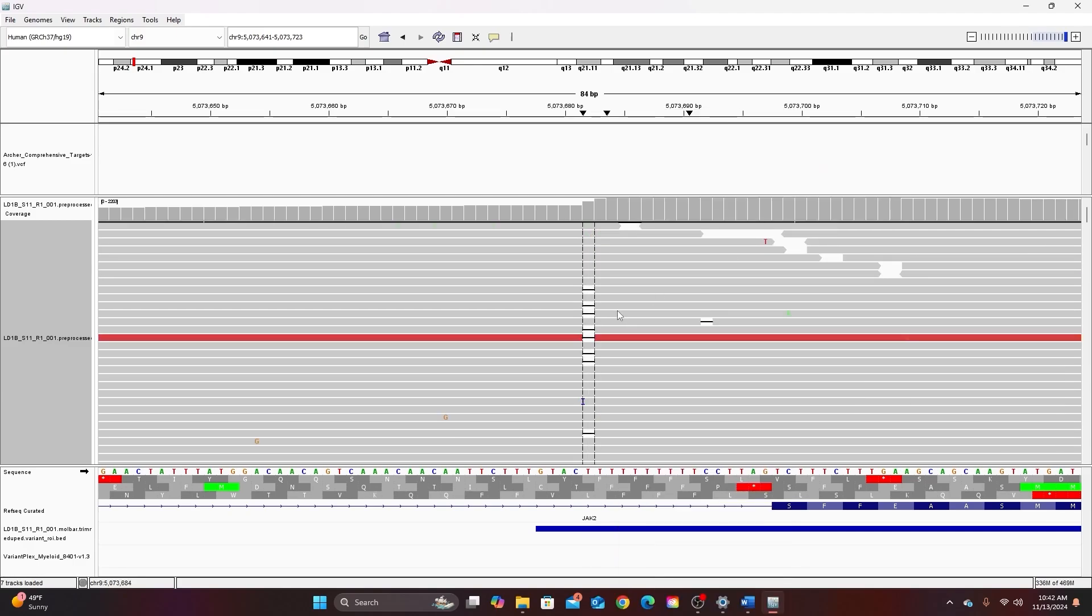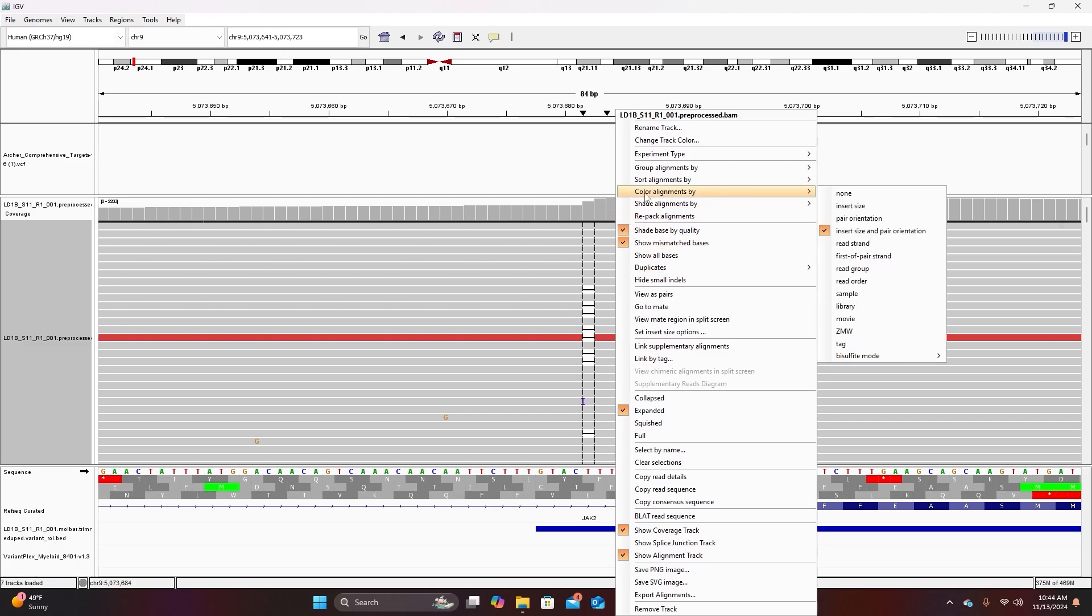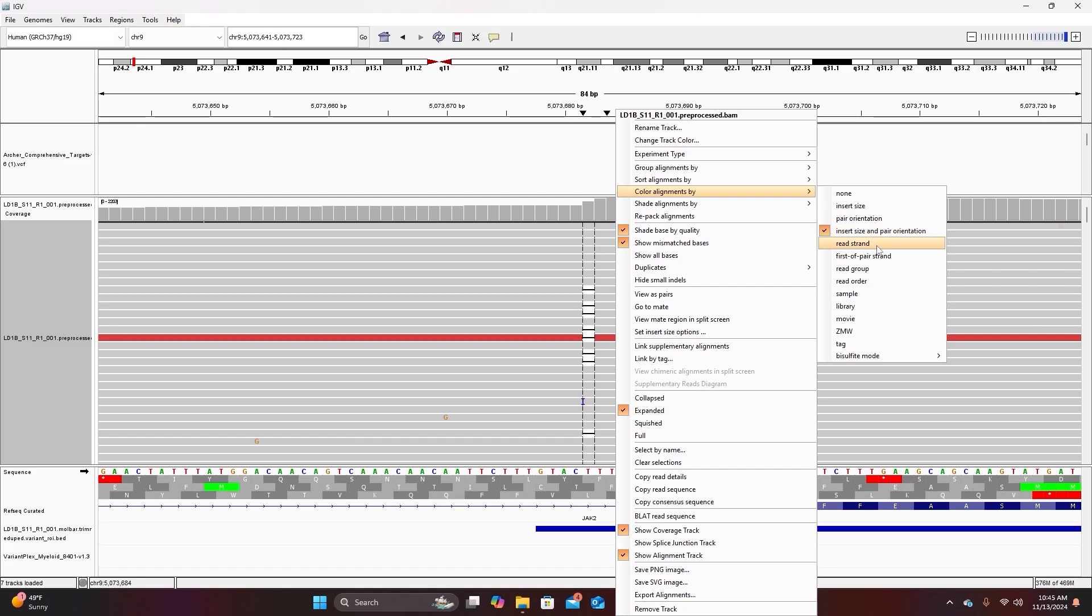So now we're back to normal. There are other color coding options so I can just right click on the alignment and go to color alignments by and you can see that my alignment automatically is colored by insert size and pair orientation. I'm going to wait until video five where we cover structural variants to explain this color coding option. This color coding option is really much more useful for understanding and identifying structural variants. For looking at SNPs and small indels it's much more useful to color alignments by read strand.